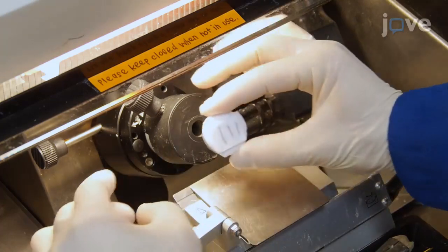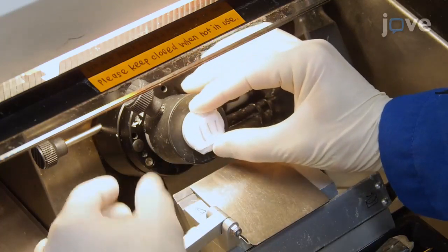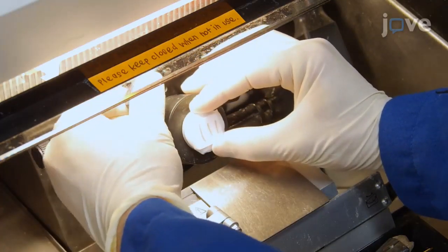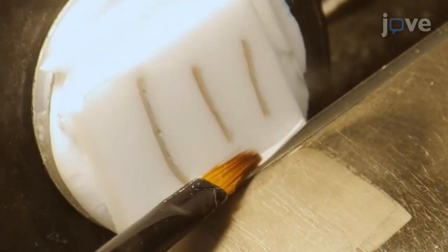For sectioning, using a cryostat set at negative 20 degrees Celsius, slice the tissue to create 7 to 10 micrometer thick sections for the best skin morphology.